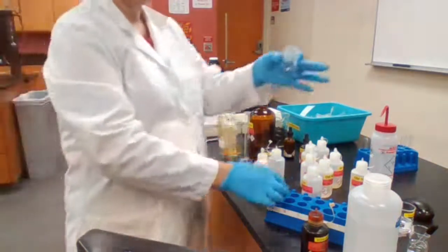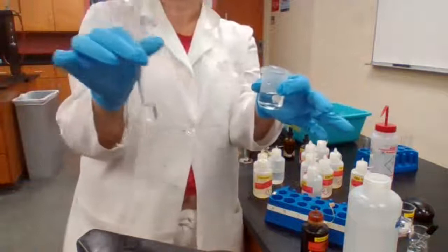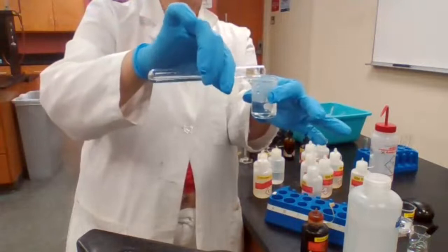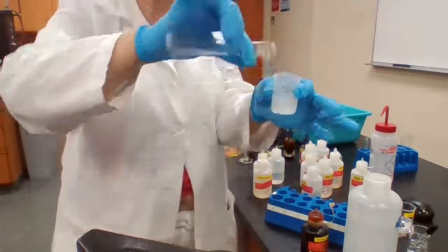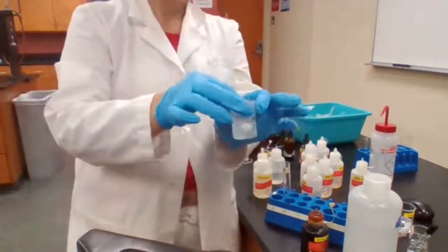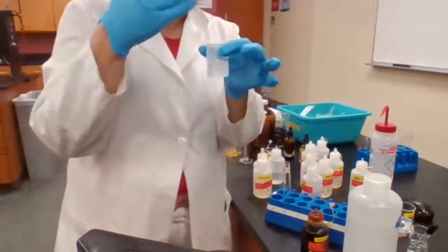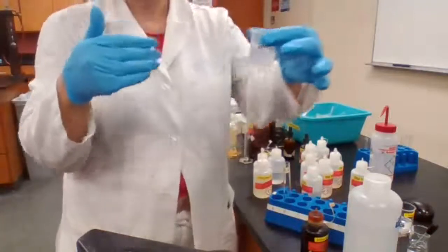And we place the ester that we had on the heat for the 10 minutes. It says to pour it into the hot water and fan it toward your nose so you can test for odor.